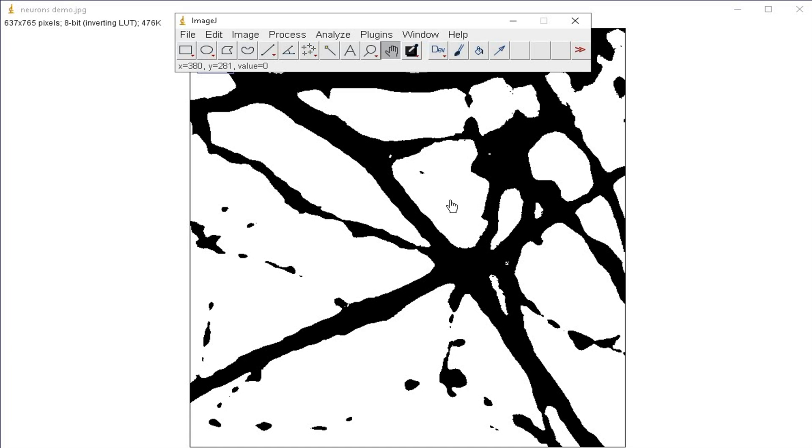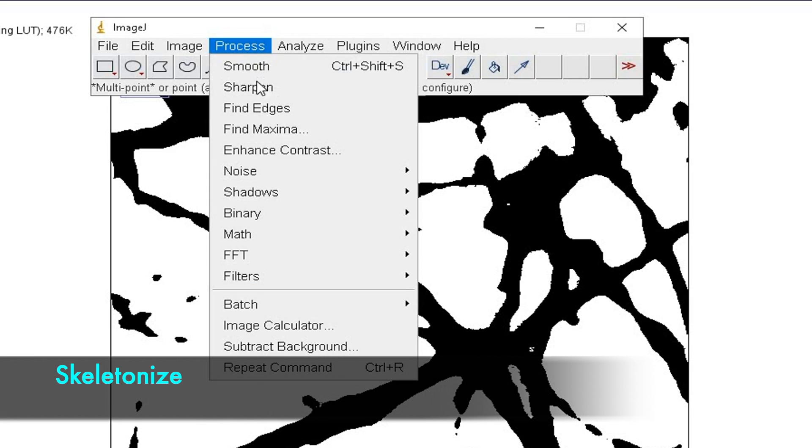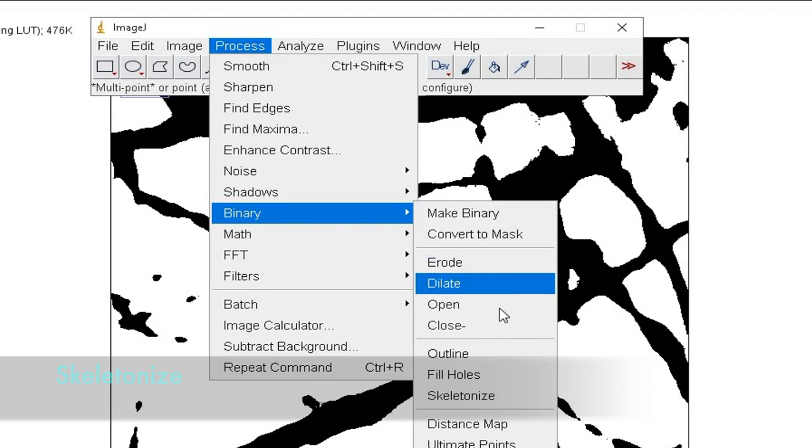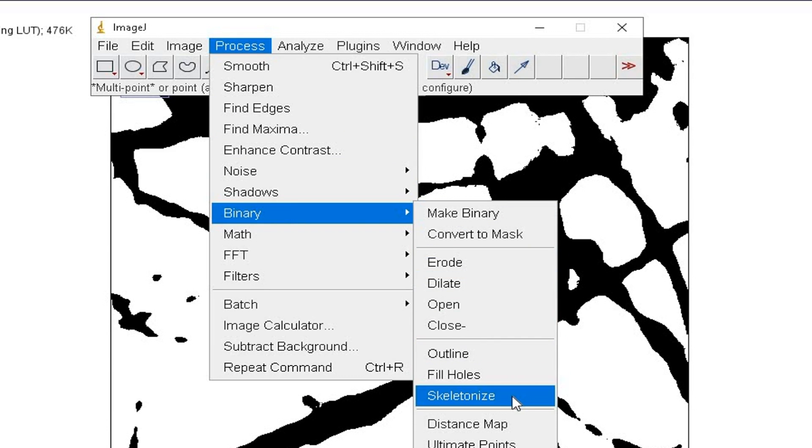Now the next step is to skeletonize the image. Click on Process, Binary, and Skeletonize.